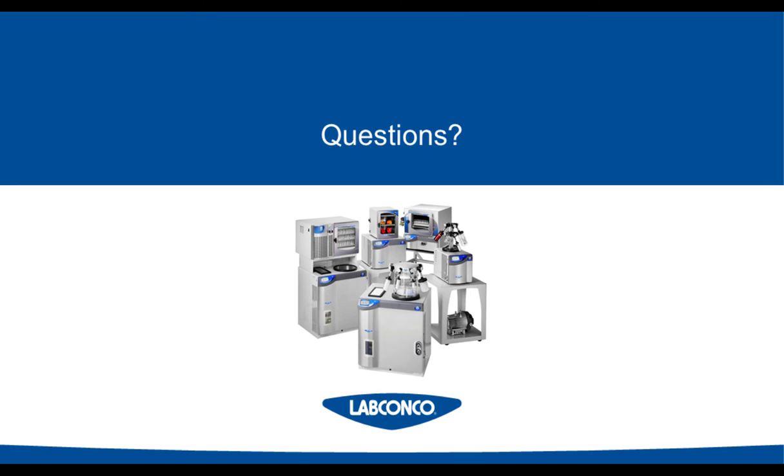So I will say that when we test our freeze dryers at Labconco before we send them out to customers, we do all of our quality control testing in a temperature-controlled room at 72 degrees. And so really anywhere between 68 and 72 is an ideal temperature to run your freeze dryer.